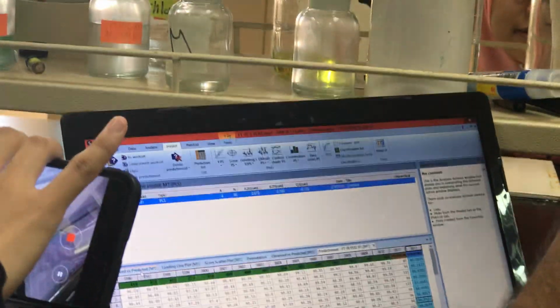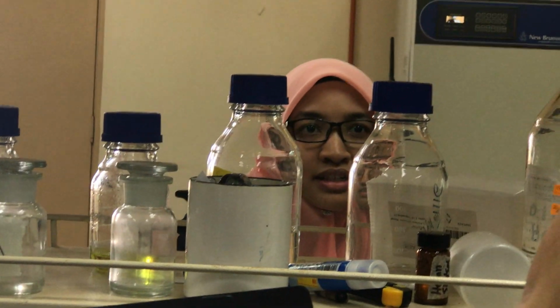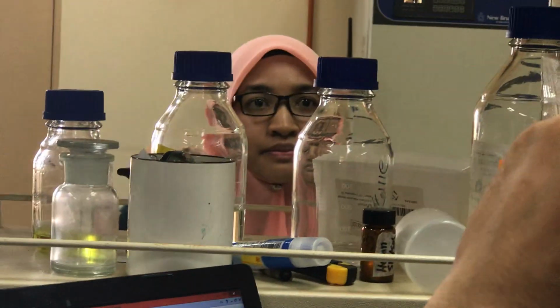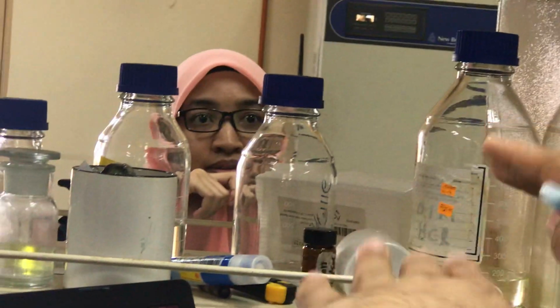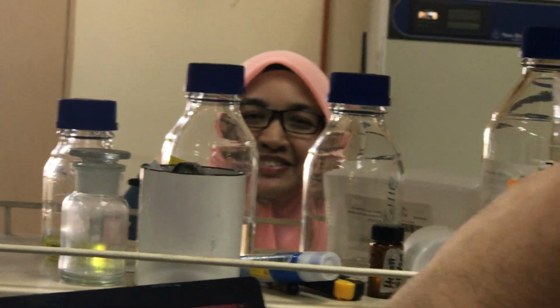To find the functional group based on the FTIR result, based on the loading plot, just based on the result. Yes, because if I'm not mistaken, the doctor did ask us to find the functional group based on the bands in the FTIR. It depends on FTIR, but the FTIR comes in the loading plot to tell you that.